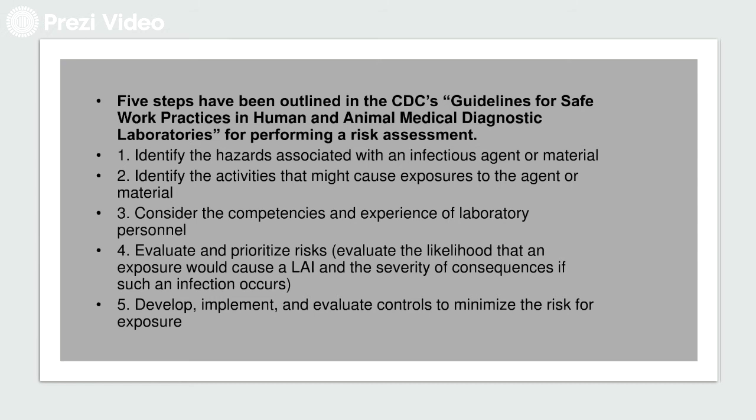What are the competencies of the lab personnel? Dapat properly trained and experienced. Evaluate and prioritize the risk. So, ano ba yung mga likelihood of exposure? And what are you going to do to develop, implement, and evaluate the controls to minimize the risk of exposure? So, yung number 5 na yan, ano yung mga ginagawa mo na procedure para mawala or minimize yung risk of exposure. So, ito yung mga safety practices natin.